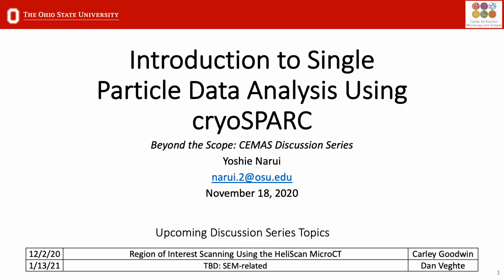That is actually going to try to measure additional parameters like defocus and astigmatism that vary from micrograph to micrograph. Now, I'm not going to go into the math or the details of all of this because that would also be another webinar. I just want to say something real quick though about CTF estimation. For those non-microscopists, the contrast transfer function is probably a little bit of a foreign concept. So I'm kind of trying to make a more practical definition. So I'm just going to give you like 10 seconds to read these couple sentences.